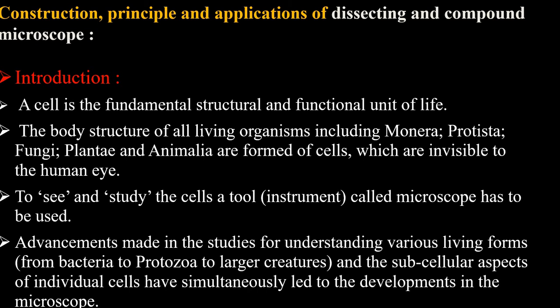A cell is a fundamental structural and functional unit of life. The body structure of all living organisms, including Monera, Protista, fungi, plantae, animalia, are a form of cells which are invisible to the human eye. To see and to study the cells, a tool, that is an instrument called microscope, has to be used.